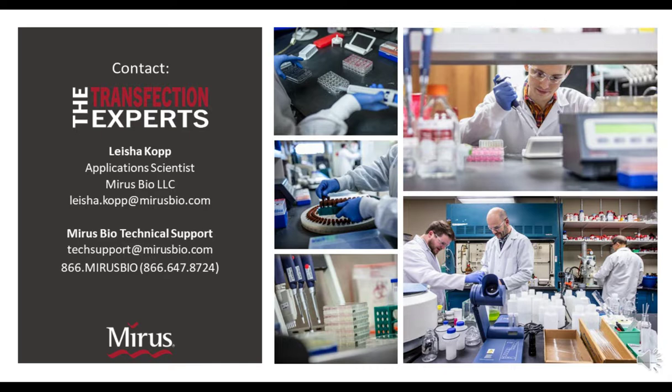We do know that complexes can be very stable out to 60 minutes. One caveat is they shouldn't be mixed during that 60-minute incubation time period. They should be just left, static sitting there. It can be at room temp or at 4 degrees. That's all fine. We do know that if it's a very long time point beyond the 60 minutes, so say up to 4 hours, we do start to see a decline.